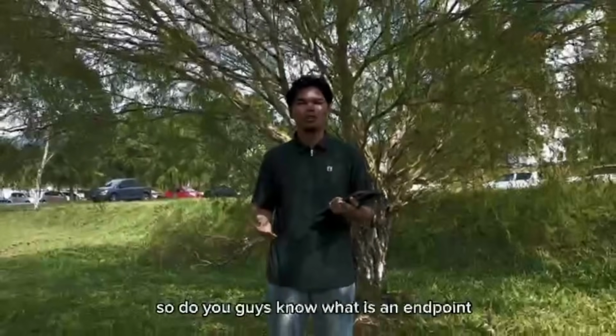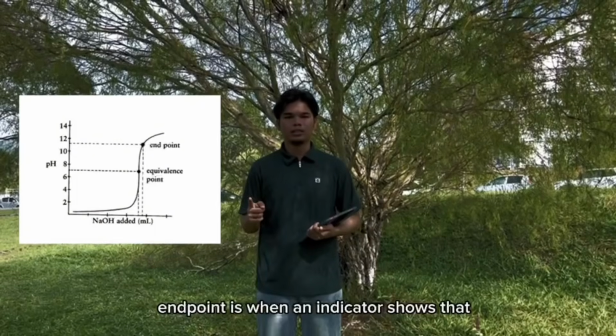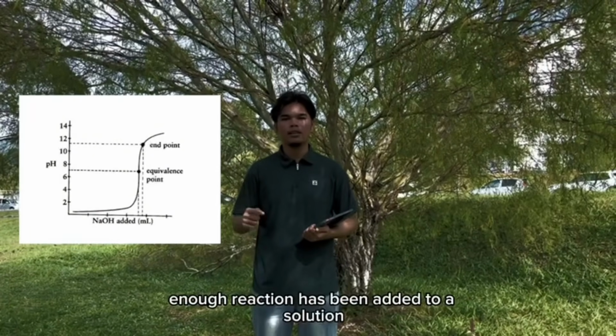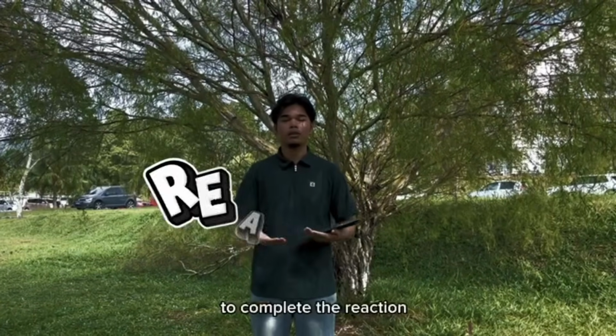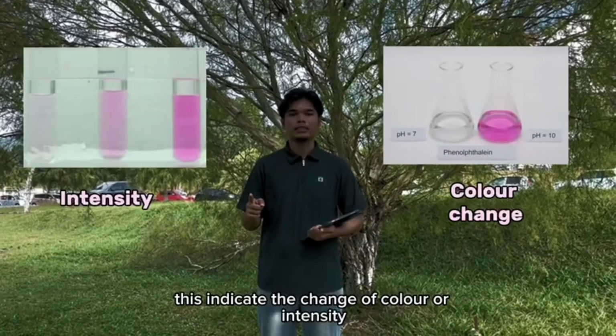Do you know what an endpoint is? The endpoint is when an indicator shows that enough reagent has been added to a solution to complete the reaction. This is indicated by a change of color or intensity.